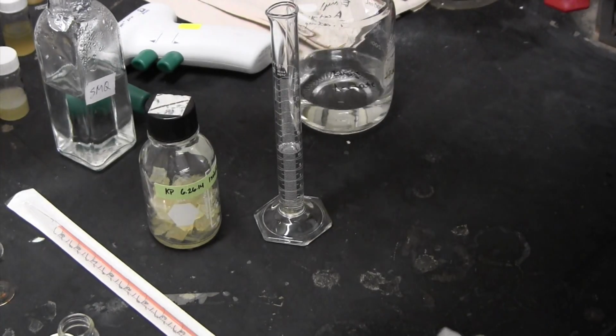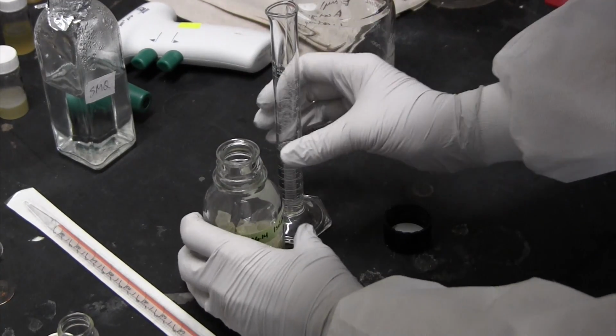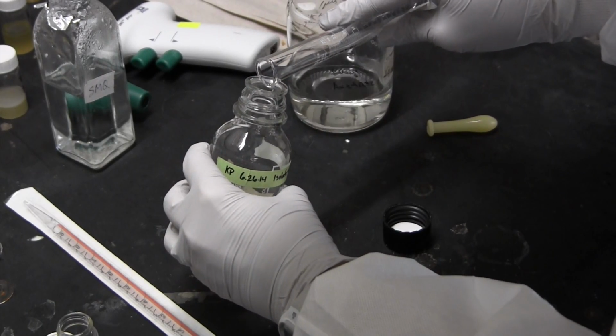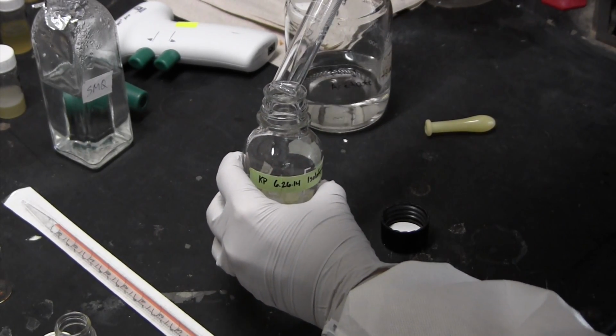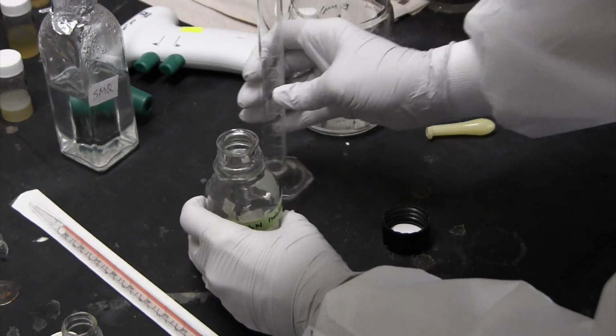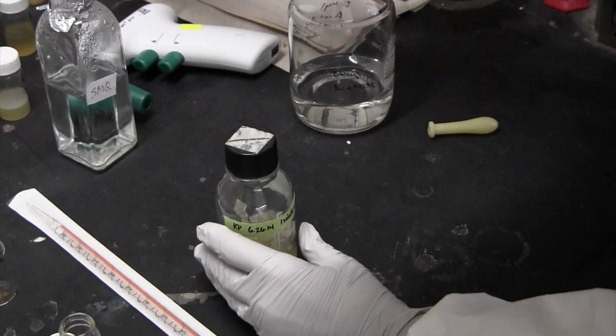And there's a glass waste in the hood that you probably can't see. And we're going to add the ethyl acetate to our jar here. We're just going to pour that directly in. And the next step is we're going to add water to this chemical extraction.